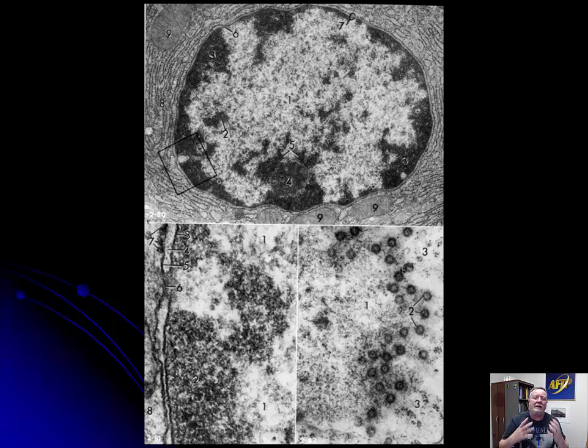Okay, so now let's look at the structure that everybody knows, the nucleus. Okay, so here's a nucleus. We happen to be in a plasma cell because we're surrounded by lots and lots of rough endoplasmic reticulum, which we're going to talk about in a minute. For some reason, somebody stuck a 9 on all of the mitochondria. I don't know why. There's a 4 on nucleoli.